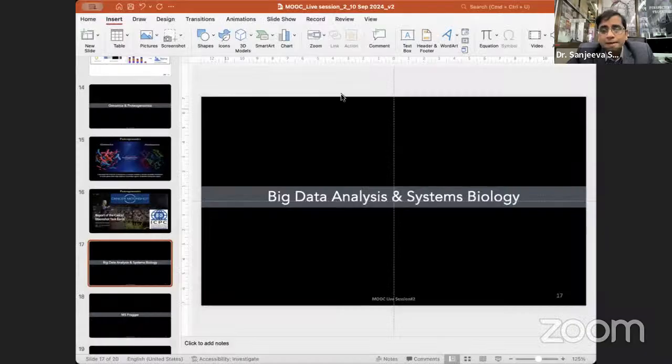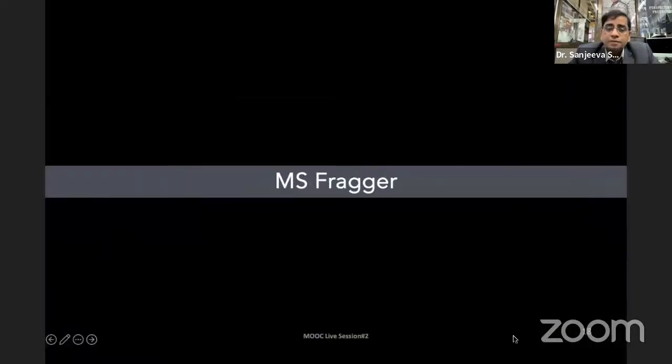So broadly now you can see a lot of data can be generated, but how to analyze the data? Timing is a bit short, but we will give you at least some flavor of looking at first the mass spec data. Mass spec data analysis can be very complicated, and the currently available software can take good RAM of your computer, and it can take a few days.